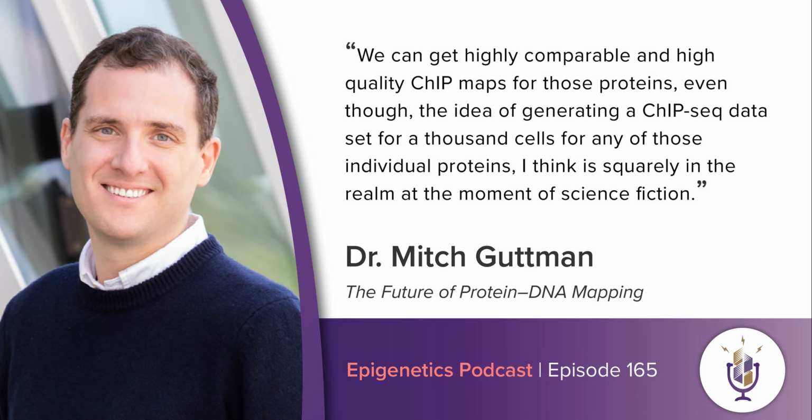But generally, the length of the reads that you need can be asymmetric, but the longer reads are on read 2, the second of the reads where you're reading the barcode itself. The chromatin, you can, of course, read at whatever lengths, single end or paired end, that are standard for different people's workflows.